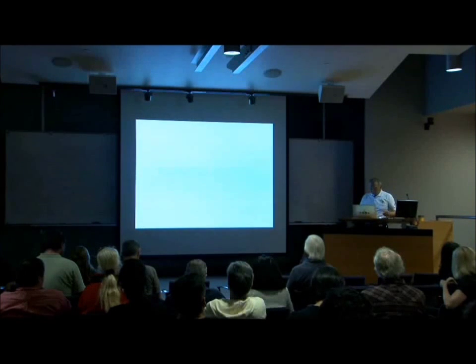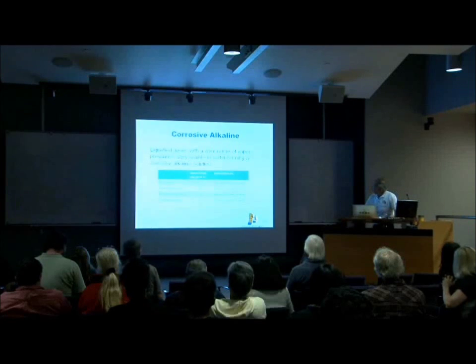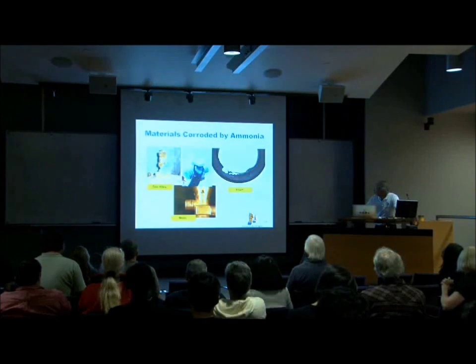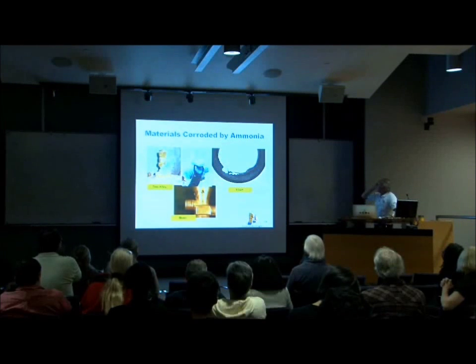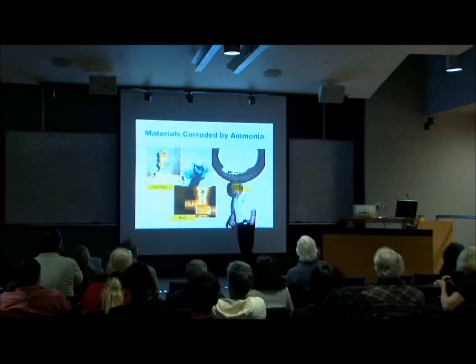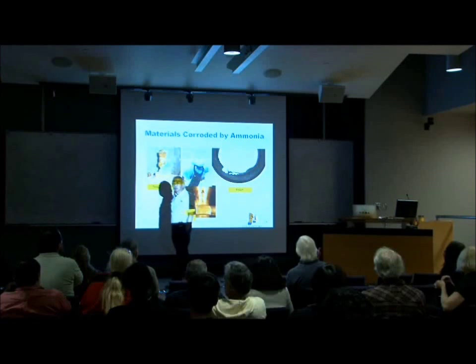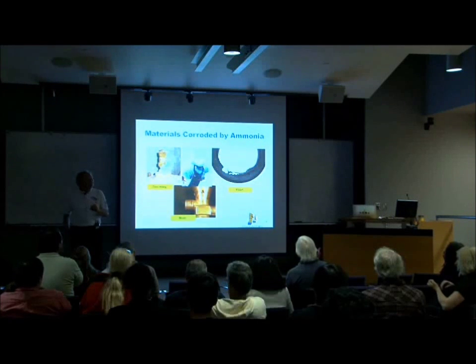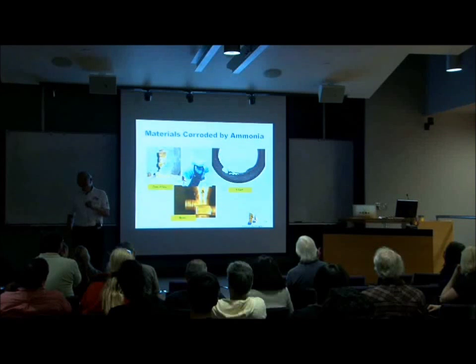Alkaline, ammonia, amines. But you also should be aware that ammonia will severely attack brass or anything containing zinc. So when you're handling these materials, you also need to know about incompatible materials.